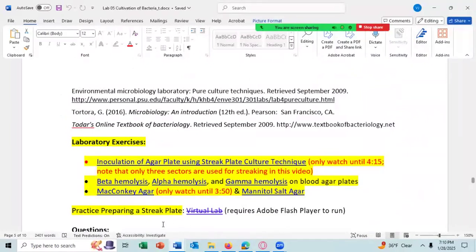All right, we have 3 little videos on beta hemolysis, showing you beta hemolysis, alpha hemolysis, and gamma hemolysis. These are all short little videos. We also have a video talking about MacConkey's agar.